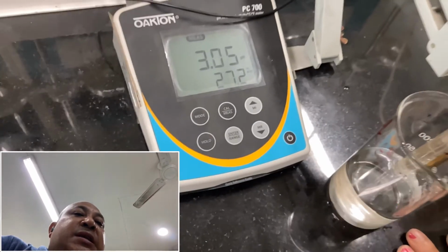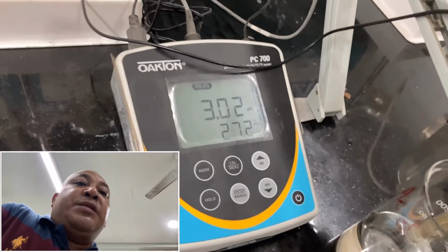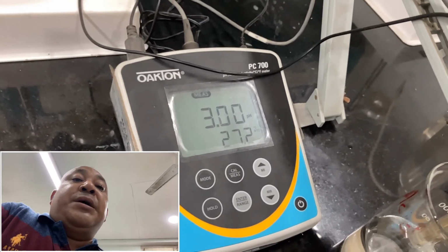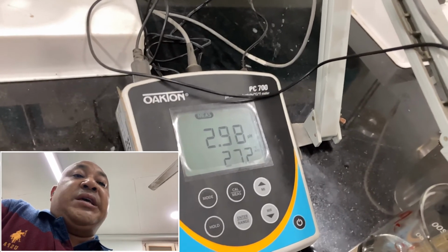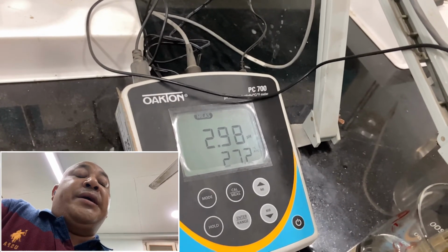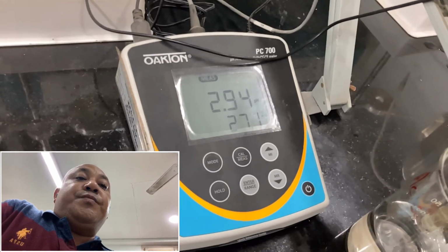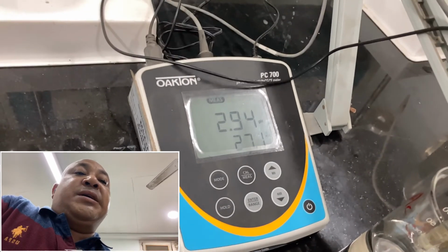Now you can see the sample is very acidic. The pH is around 3.05. That means the hydrogen concentration is 10 to the power minus 3 moles of hydrogen per liter. Since 1 mole of hydrogen is 1 gram, we can say this is around 10 to the power minus 2.98 grams per liter of hydrogen ions. So this is acidic pH, and this way we measure the pH.